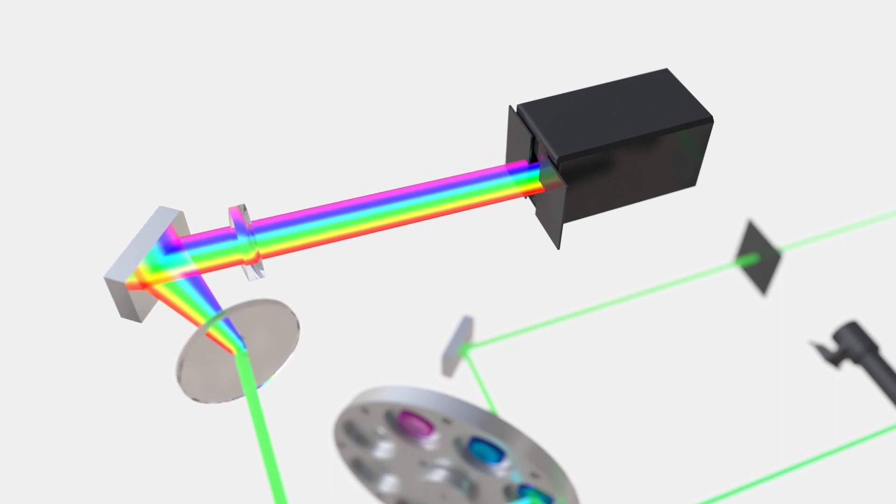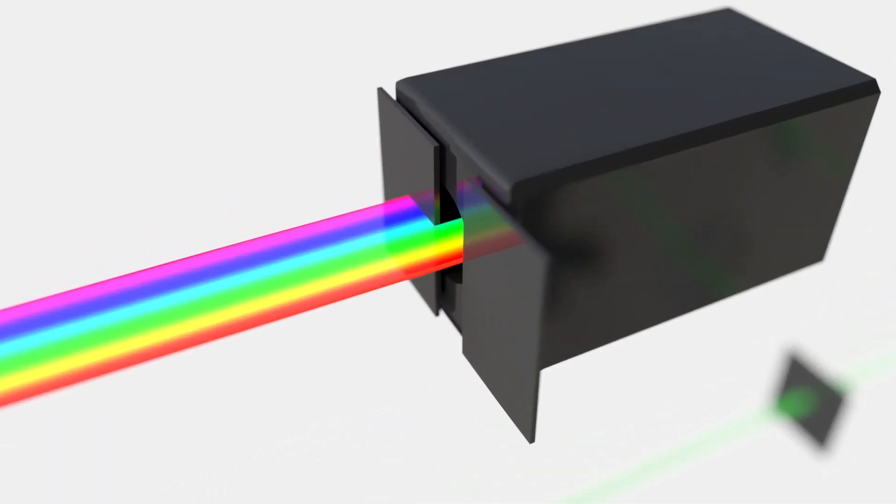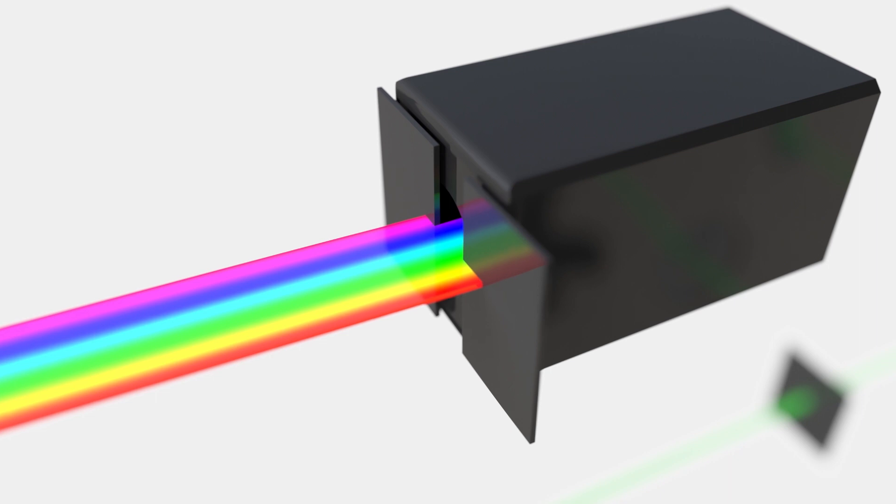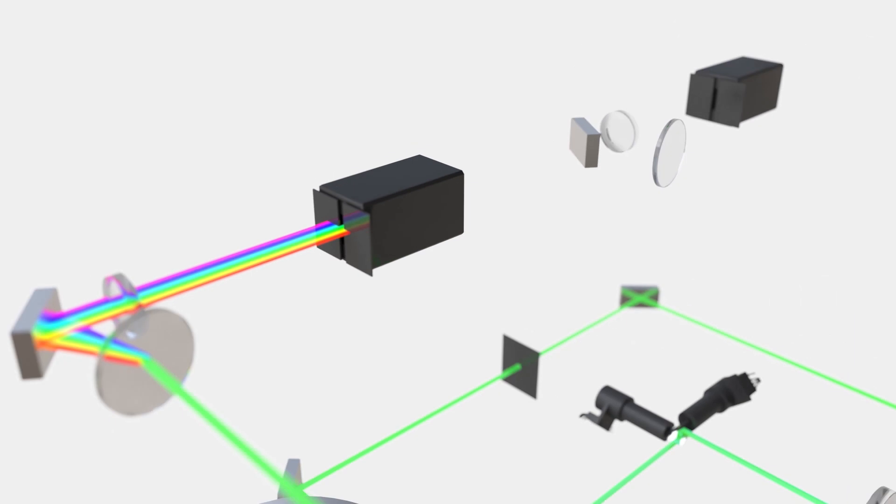A motorized adjustable slit in front of the TrueSpectral detector creates bandwidths from one nanometer up to 100 nanometers, giving users maximum control over the light they collect.